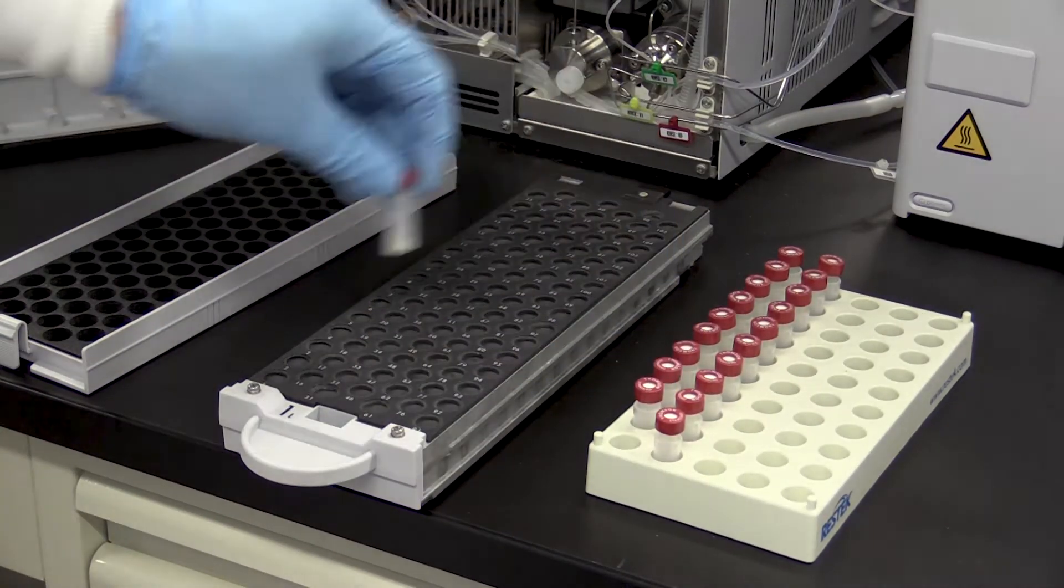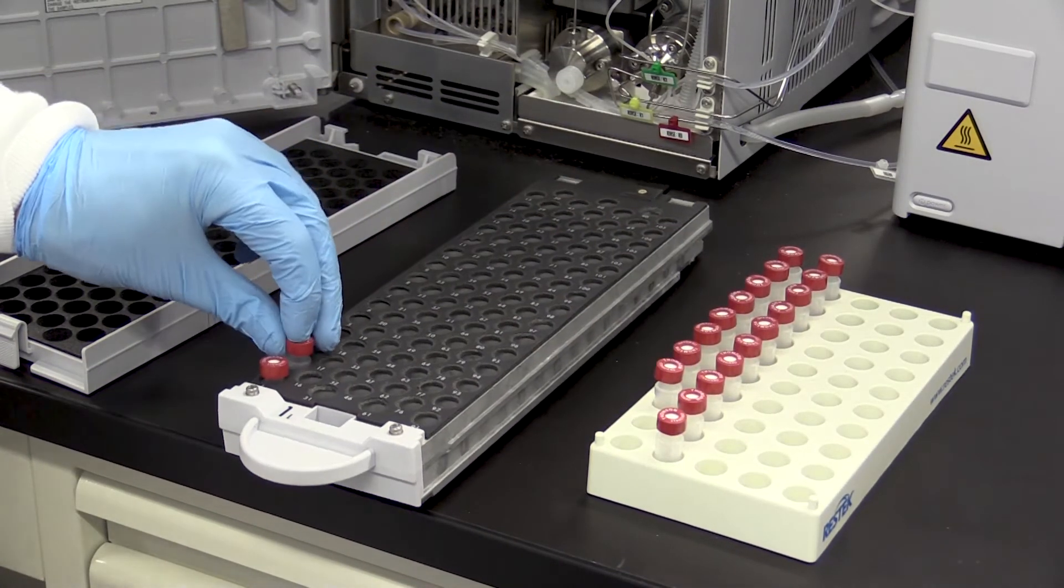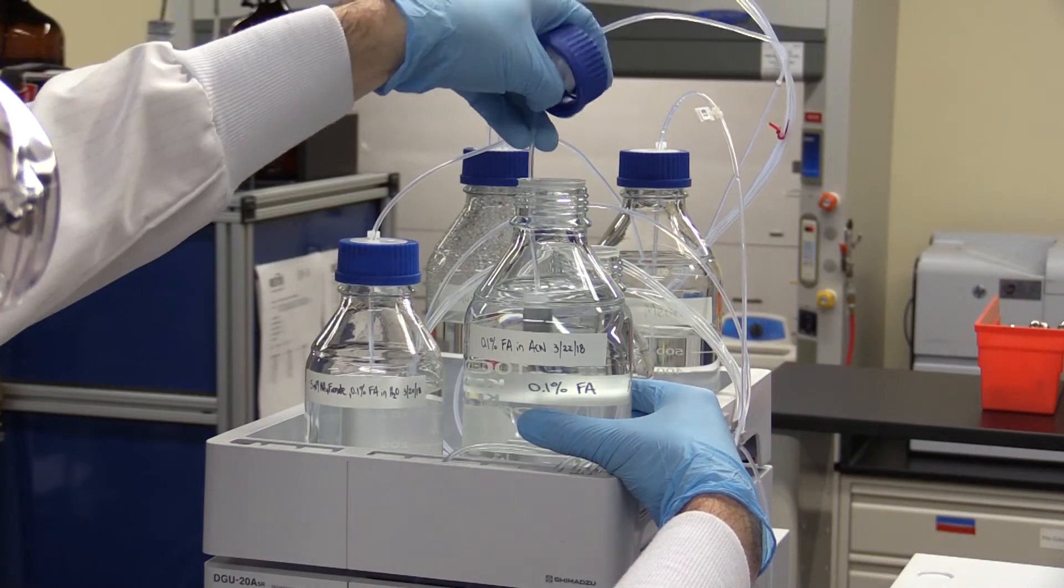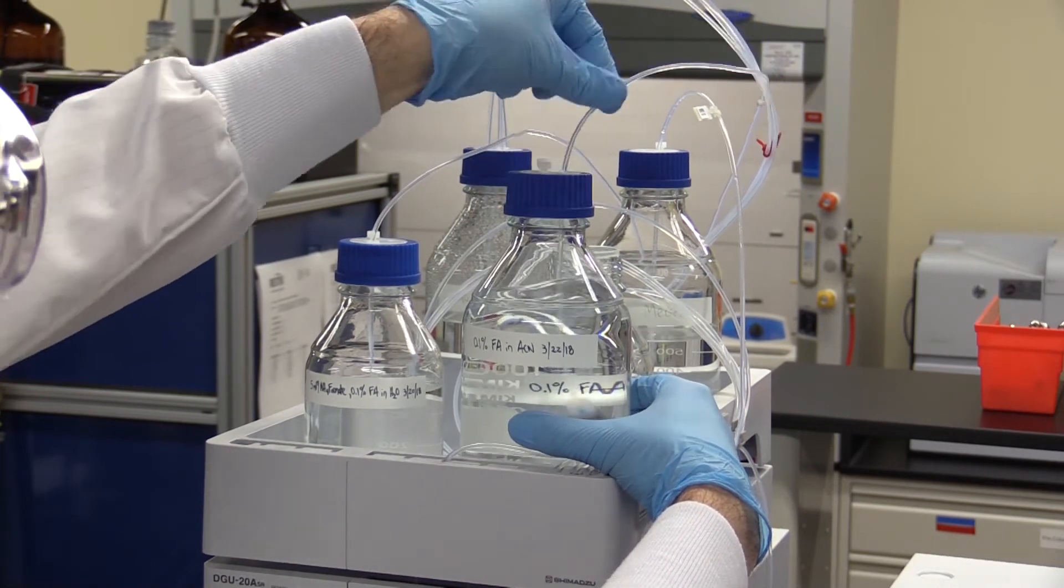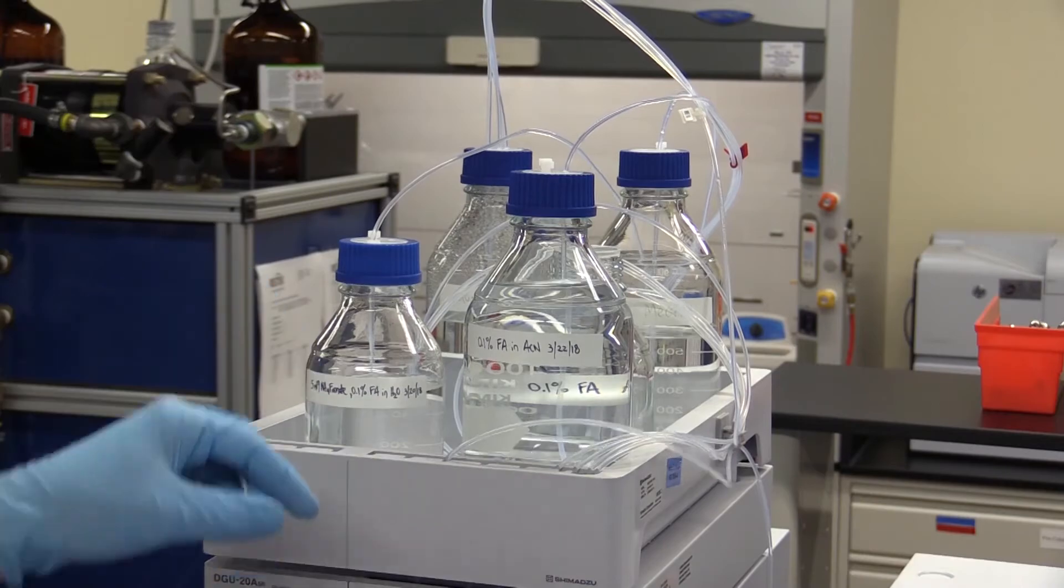Once all of your samples are prepared, place them in the auto-sampler tray. Before you start your analysis, make sure your mobile phases are freshly prepared and that you have sufficient mobile phase for the number of samples you're analyzing. In addition, using bluestem filters helps provide clean mobile phase to extend the lifetime of your column and pump seals.